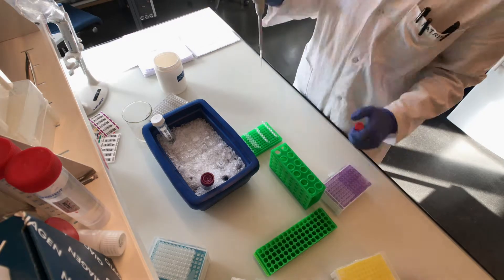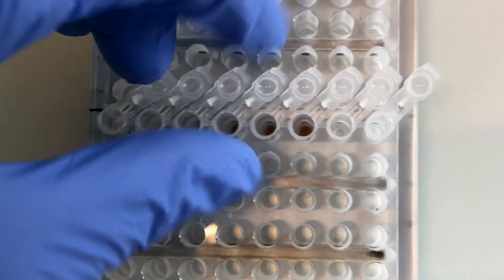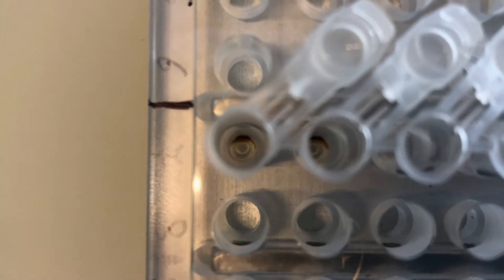To clean up our sequencing libraries, or in other words remove all the dirt, we add a suspension of magnetic beads. The DNA binds to the surface of those beads, which we can push aside using a magnet and remove the liquid with all the dirt.